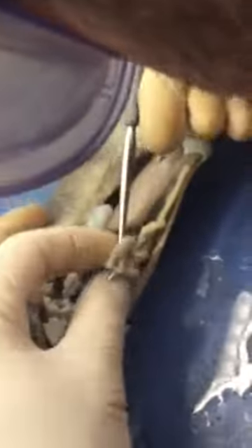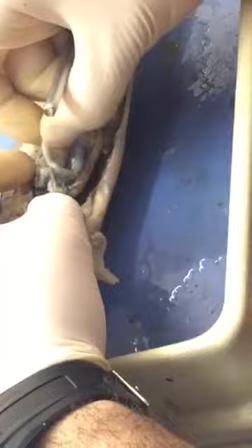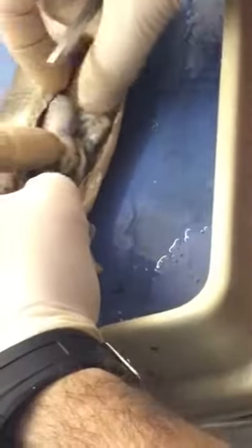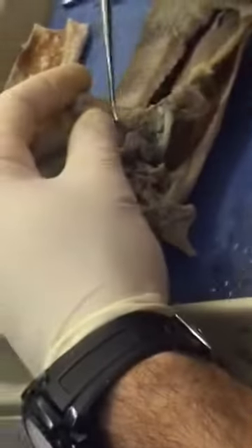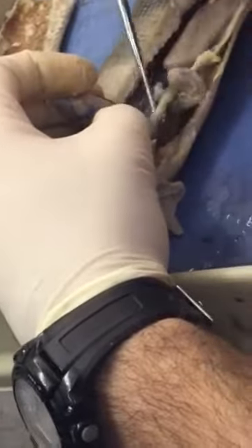There we go, right here. I'm just separating out the blood vessels right now.